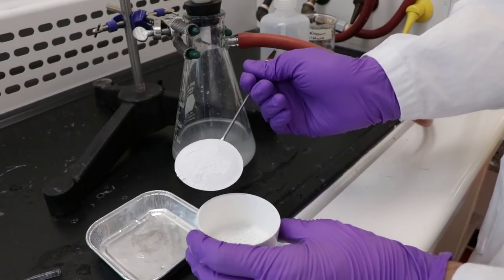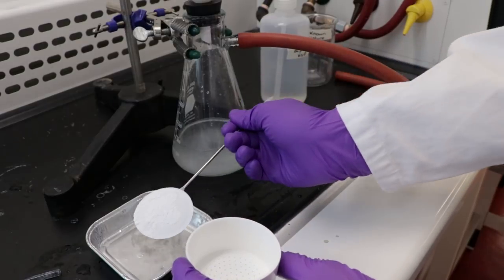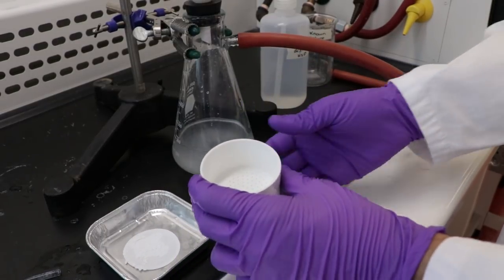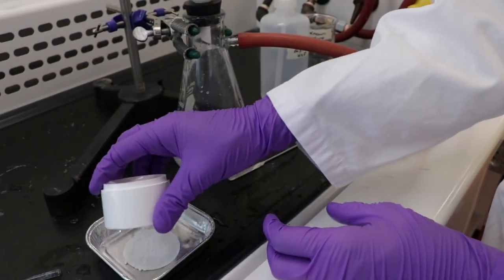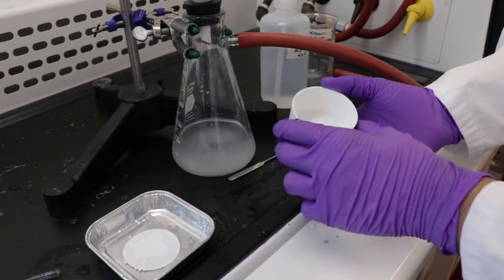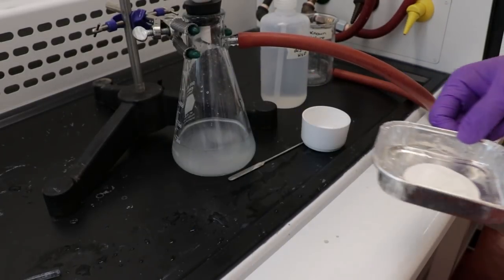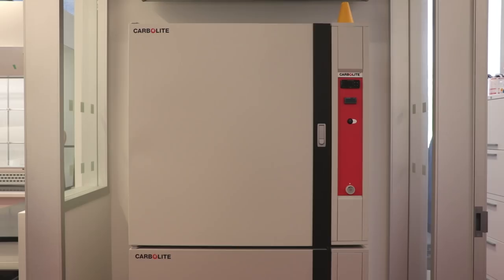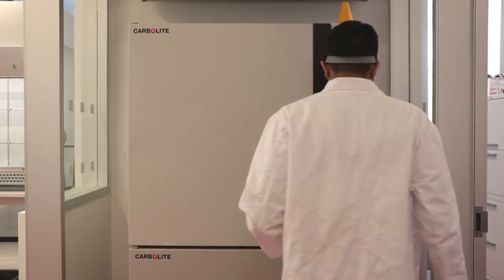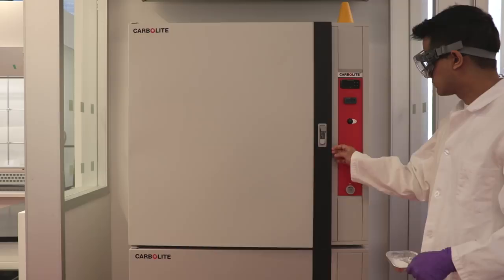Using a metal spatula, scoop the filter paper into a pre-weighed aluminum boat. Place the filter paper and aluminum boat in the oven. Heat between 30 to 45 minutes.